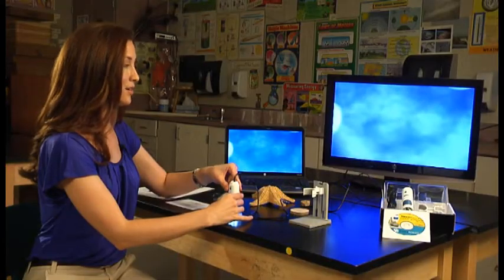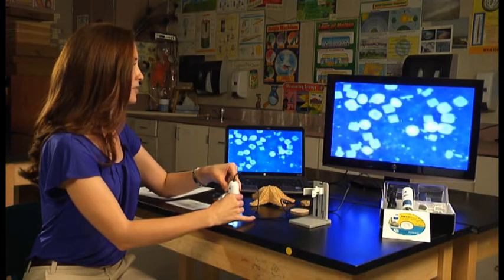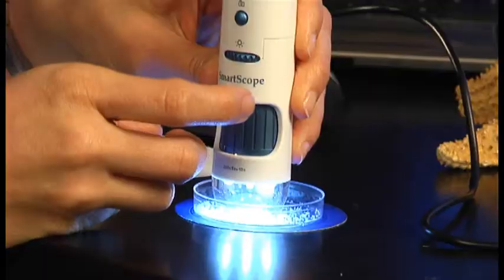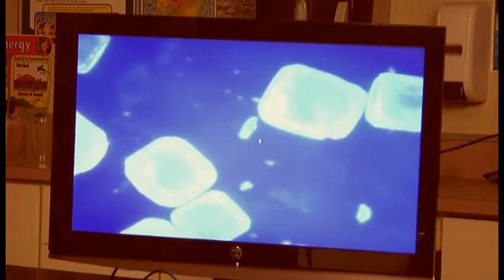Like I mentioned, be sure you have the focus wheel turned all the way to the right. And then just place it directly on the salt. Slowly turn the wheel to the left. You'll see the salt come into focus right there at 100x. And then you can continue to turn it. And we can focus all the way in to 200x magnification.